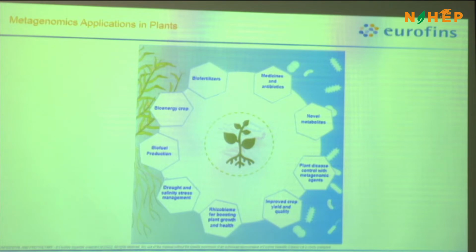We will assemble, do the metagenomic analysis, and then take out the virome, which are the viruses present in that 10% data, and identify what the infection was in that particular plant. So if there is an unknown infection, one which we are not aware of, then we can do this approach and identify what type of pathogen, what type of viruses, bacteria or fungi have infected the particular plant.